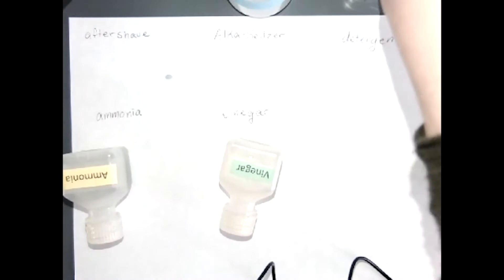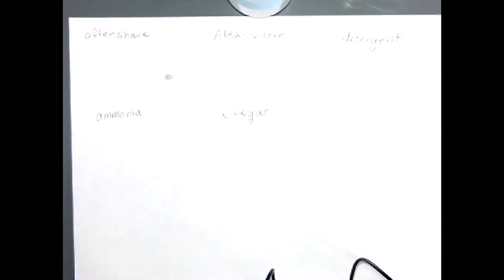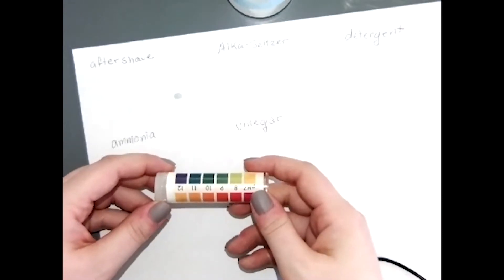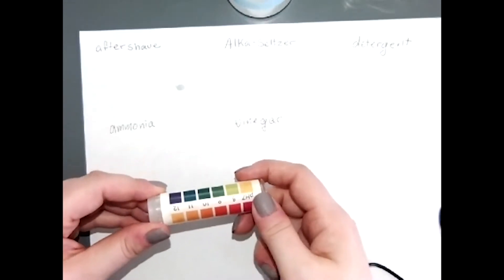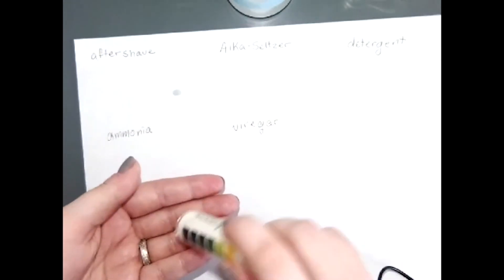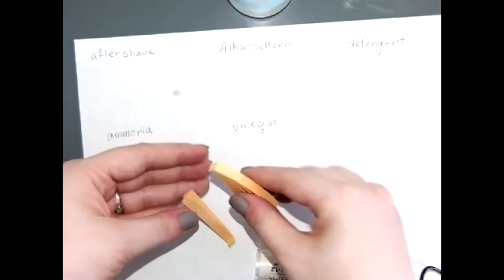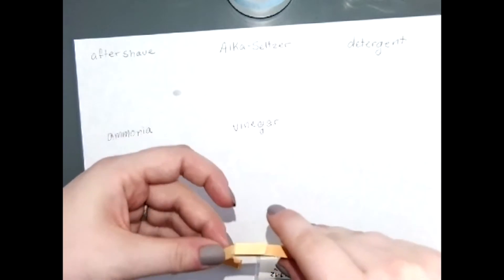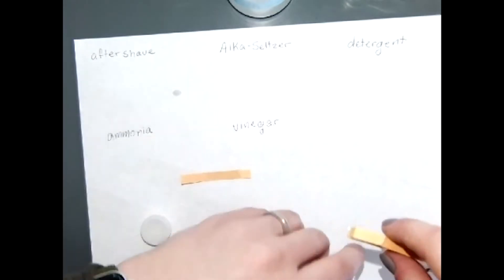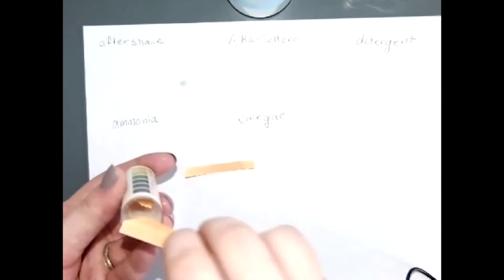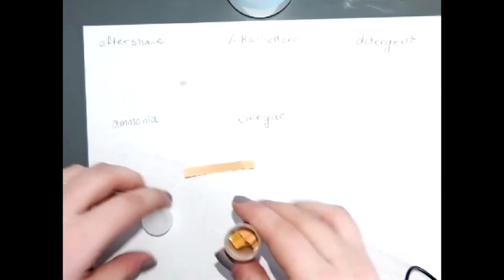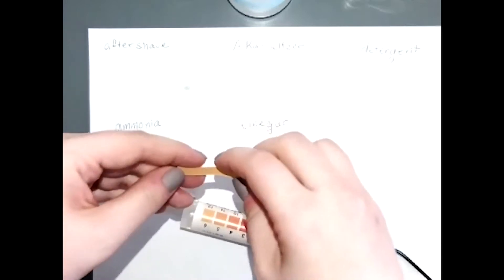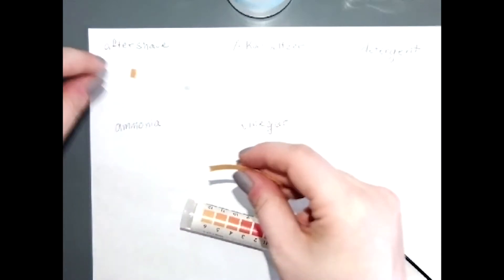We have aftershave, alka-seltzer, vinegar, ammonia, and detergent. What we're going to do is test the pH of each of these with pH paper. If you have never used this substance before in the lab, it arrives as little strips of this papery material.